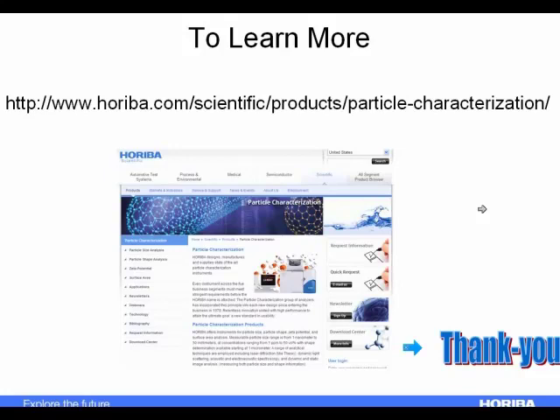The H is there because it's the hydrodynamic diameter: you can think of it as the sphere of what diameter would diffuse with this diffusion coefficient. When looking at DLS data, it's always the hydrodynamic diameter. And for non-spherical particles, be forewarned, it may be different than what you'd see from a microscope or other technique.